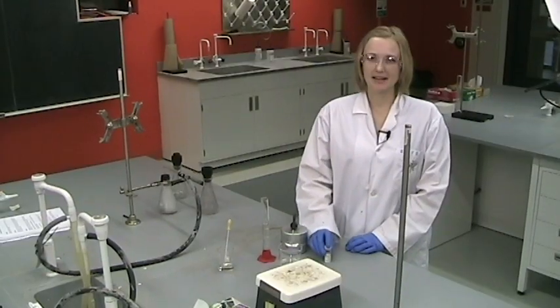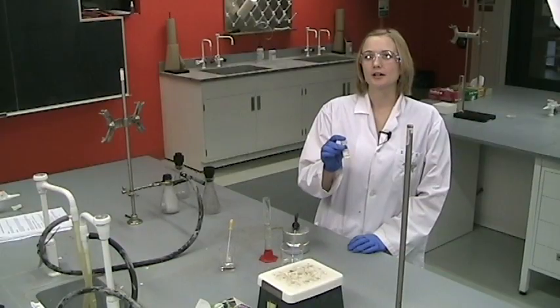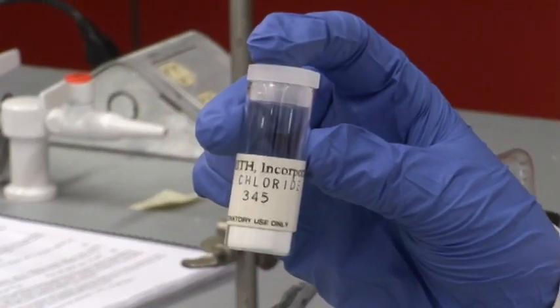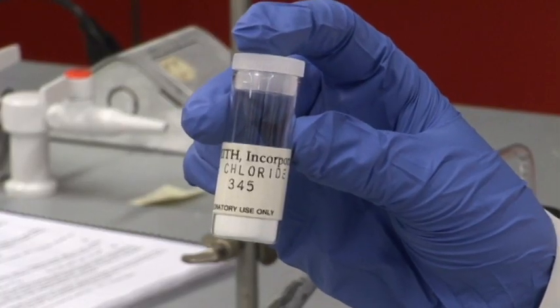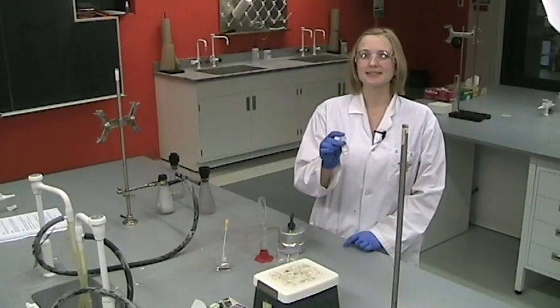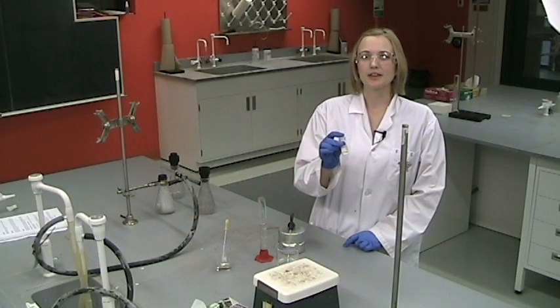You'll start by getting a salt sample which has a number on it. That is because these are unknown salts with different percentages of chloride by mass. You'll need to record the sample number so that at the end of the lab your TA can give you the accepted percentage of chloride in the salt and you want to make sure you get the right number.